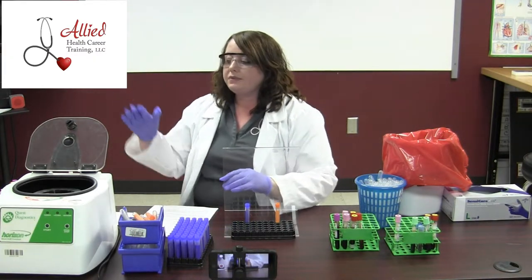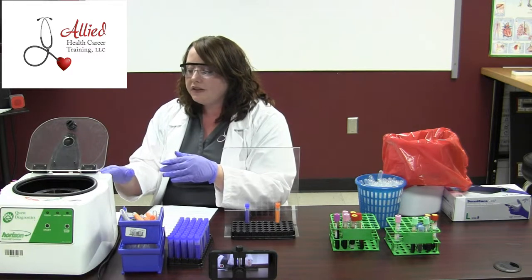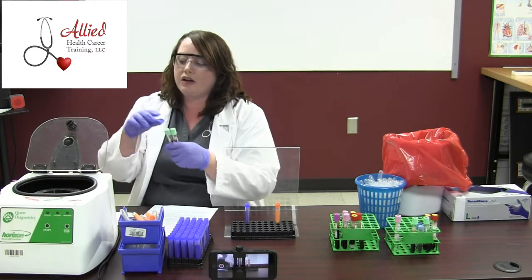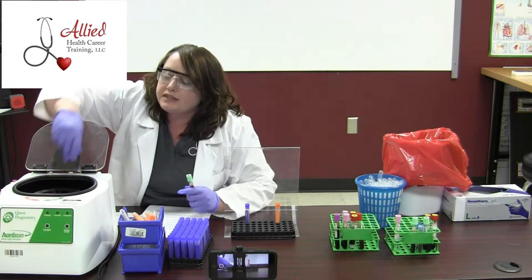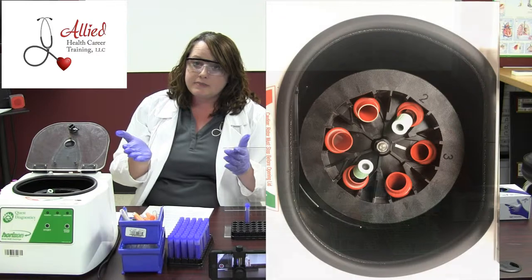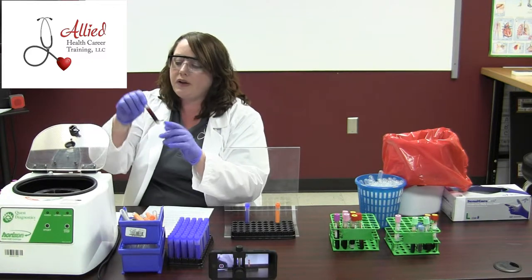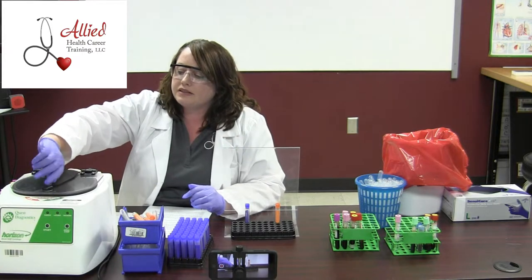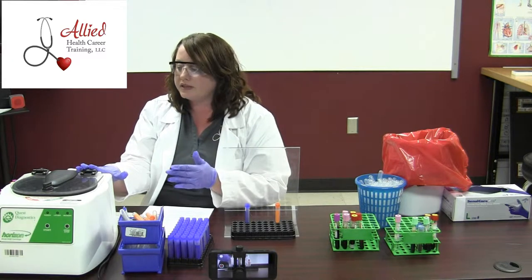Now the way we go about doing this is we're going to use a centrifuge. This process can take anywhere from a minute to 15 minutes — it really depends on your centrifuge, how old it is, and what it recommends. The big thing about the centrifuge that you have to remember is to always balance. If you're going to put a specimen in it, you're going to want to put another one across. If you only have one specimen, water is about the same weight as blood, so just fill the water to about the same fill line as the blood, latch the lid, and turn it on. Some centrifuges require a timer; some will automatically stop — it just depends on how old your centrifuge is.